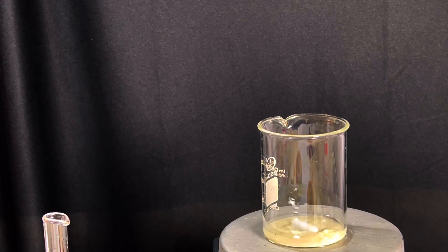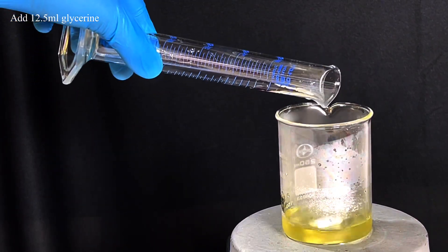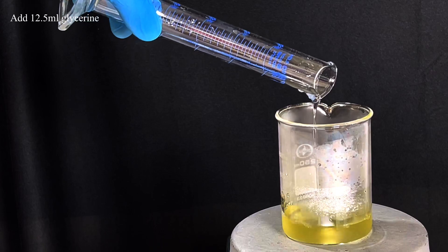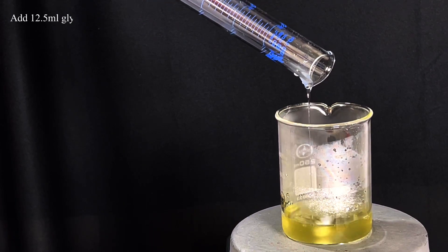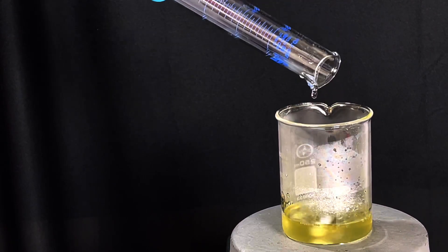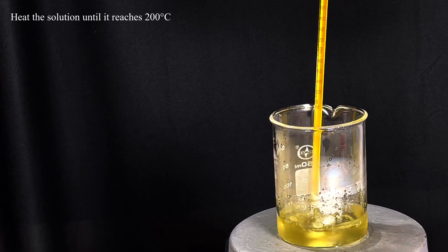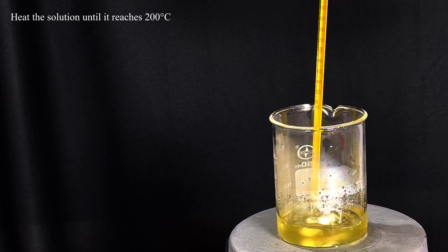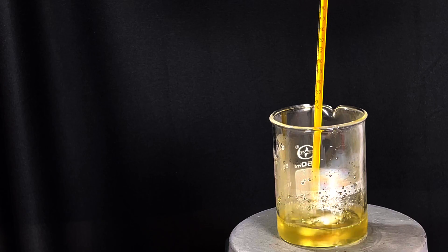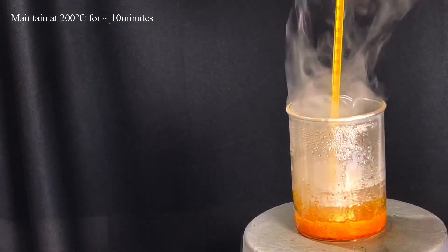When the solution turns clear, 12.5 milliliters of glycerin was added to the beaker. Place a thermometer and start heating the contents of the beaker. Initially, water boils away and then the contents slowly change color into a dark yellow-orange. The temperature was maintained at 200 degrees C for approximately 10 minutes.